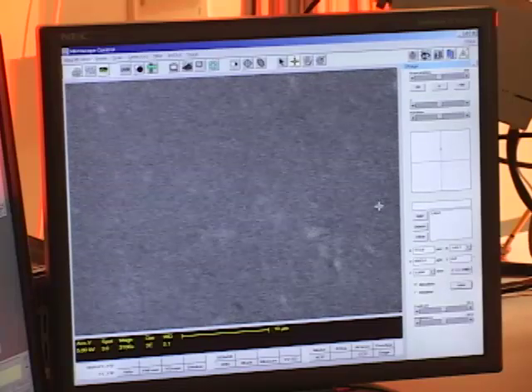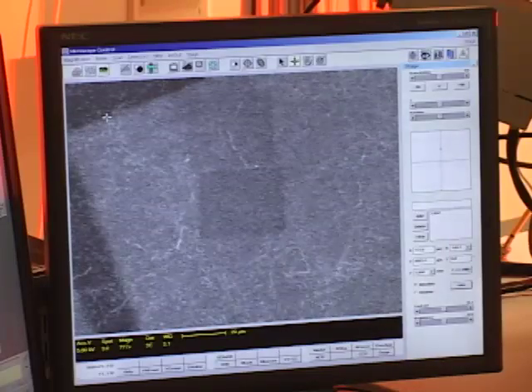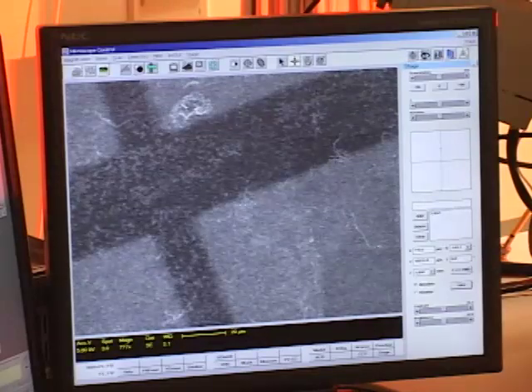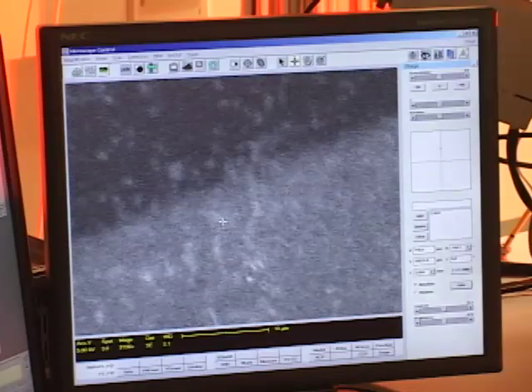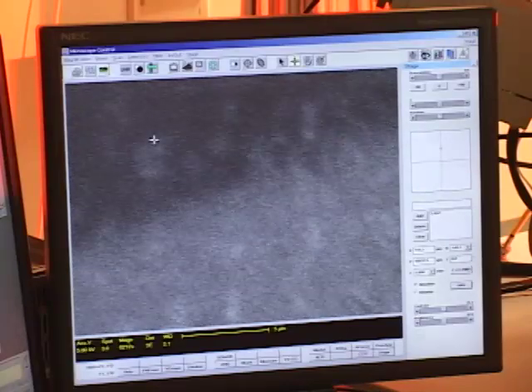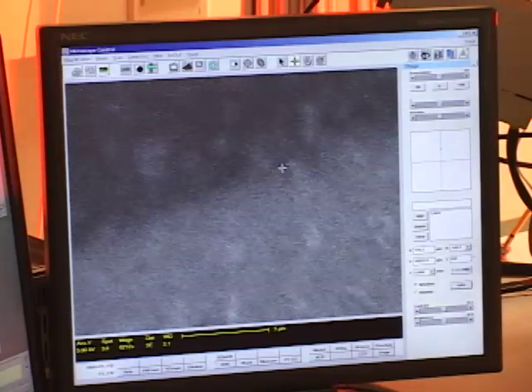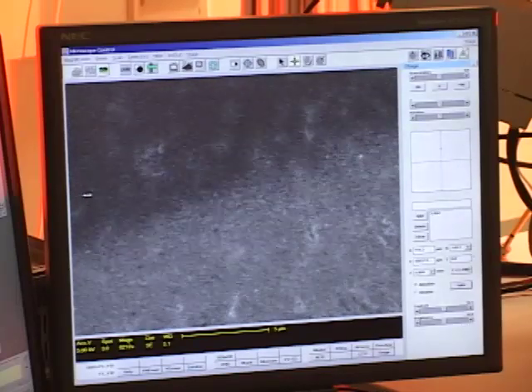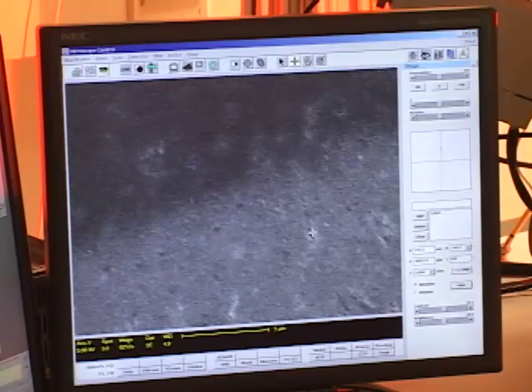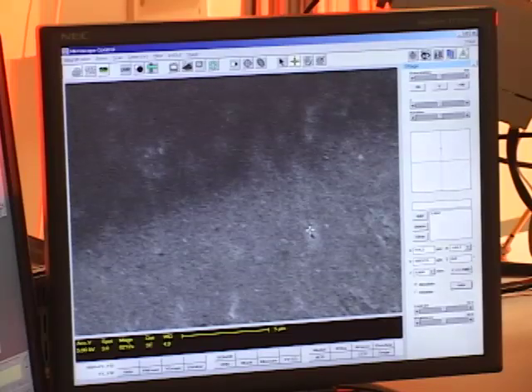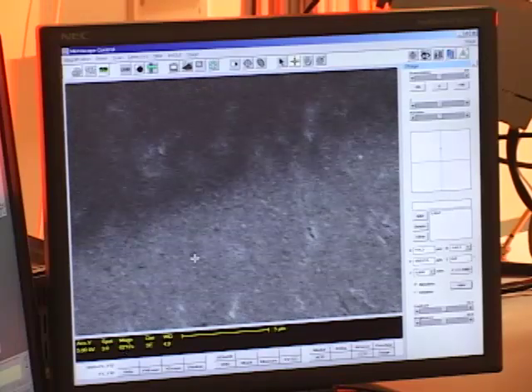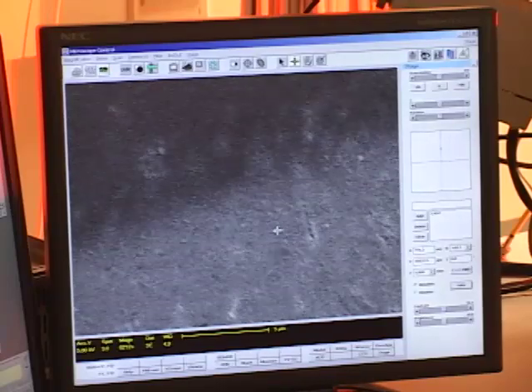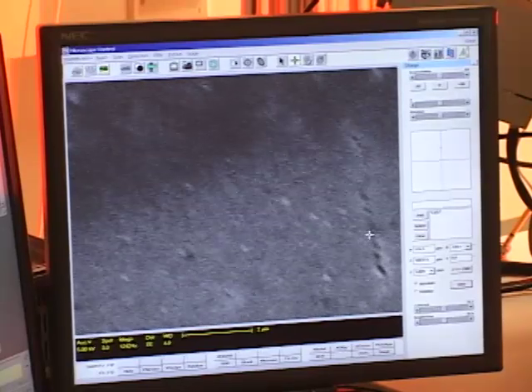So I'm going to zoom out. And I'm going to move to a position that has better contrast. So you see on the edge of this group of nanoparticles, there's a blank space. That's black carbon. And I'm just going to zoom in to this area where I've got both the bright and the dark in the same field of view. And I'm going to try and focus the boundary between the two as best I can. You can also see that some of the defects, blemishes on the sample become visible when I'm in the right focal plane. The next thing I want to do, I'm in focus at 6,000. I'm at my final working distance of 5 millimeters. I want to zoom in to 10,000 or more. And we'll do the beam optimization.